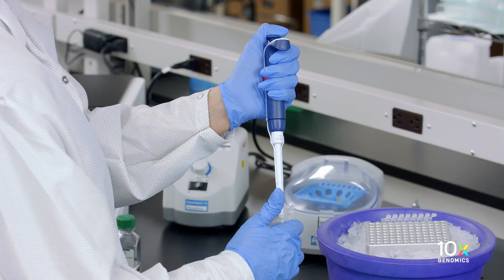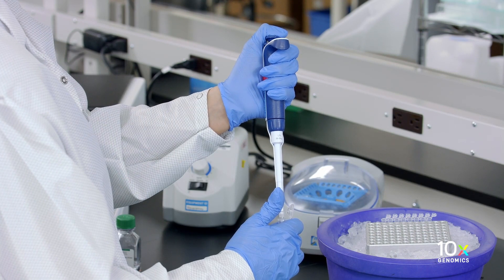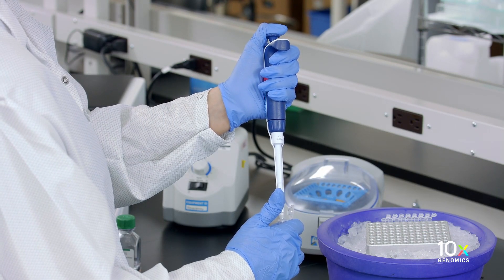Now we are ready to add the single cell suspension into our master mix. Gently pipet mix the single cell suspension before adding the appropriate volume into the master mix. Depending on the cell type the cells may settle down to the bottom of the tube.